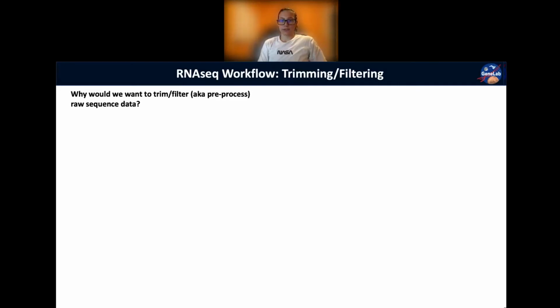Cut out any adapter sequences, right? To not confuse mapping, remove adapter sequences. We won't be removing duplicates in the trimming, but that's something that we could do. There are some trimming tools, Susie, that can remove duplicates in the trimming step. Chief, you said you do not need everything, just what you're interested in.